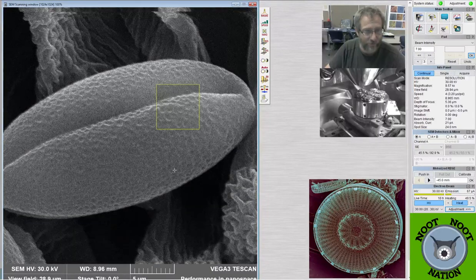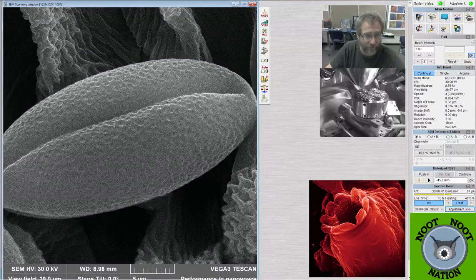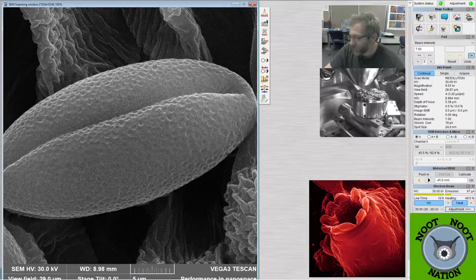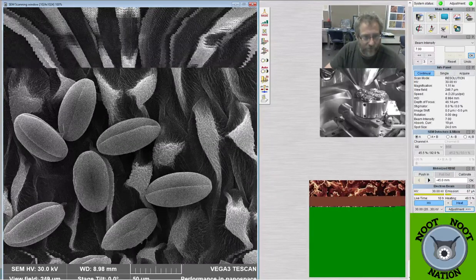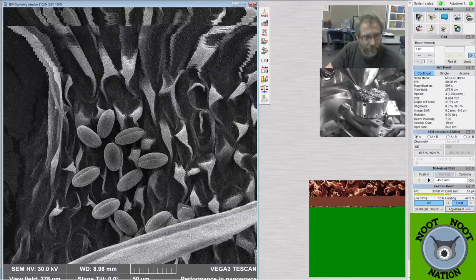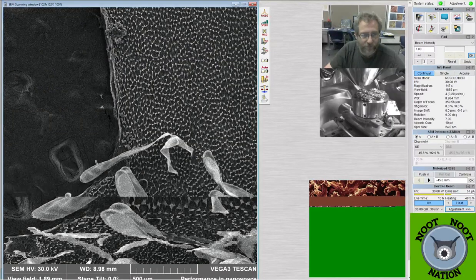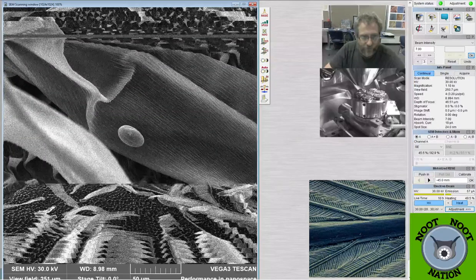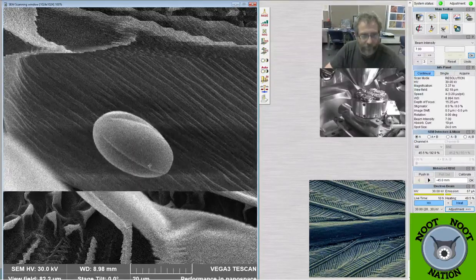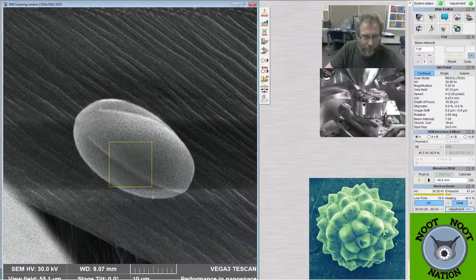It does look kind of similar to the pollen that we looked at in the past, the redbud, but I didn't actually have the redbud and the violets on the same stub or anything like that. So unless it got transferred from my hand or the tweezers I was using, which is totally possible, that's probably violet pollen. I'm going to look around and see if there's any other kind here, in particular on these things. Yeah, it looks pretty similar here. And I think these are either the part that collects pollen or produces pollen for the plant.